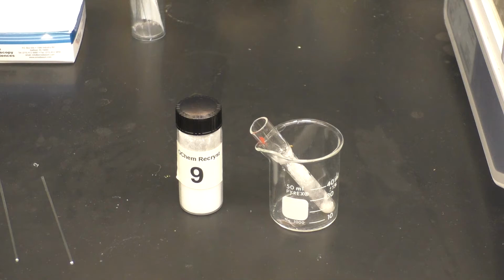Now that we have our purified material, we will prep melting point samples for both the purified material and the original impure unknown. After taking those melting point measurements, we can then prepare a mixed melting point with the purified material and the known compound that we believe it to be.